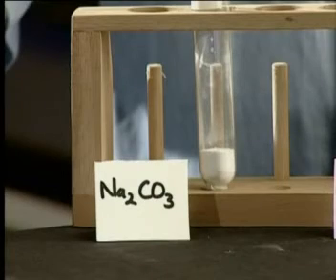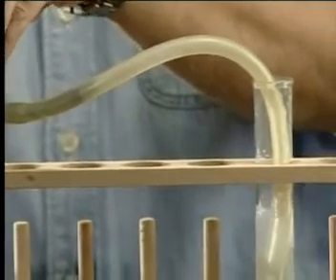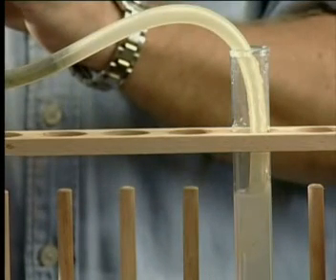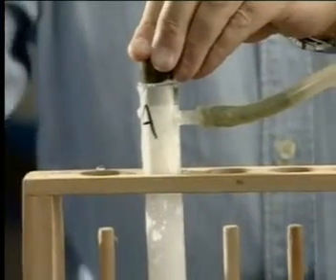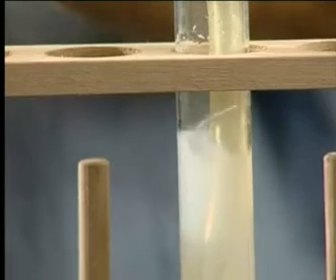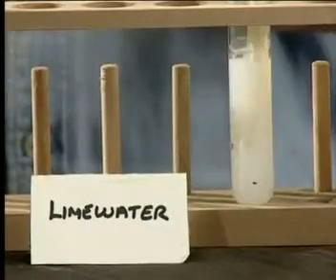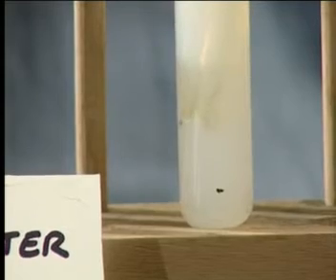If the clear lime water turns milky, then we have a positive test for carbon dioxide. We will use a sidearm test tube containing a sample of dry sodium carbonate. A rubber tube is attached to the end of the sidearm so that the gas released can be bubbled through the solution of clear lime water. Now, add a little dilute hydrochloric acid and allow the gas to bubble through the lime water solution. You should be able to observe that the lime water is turning milky.